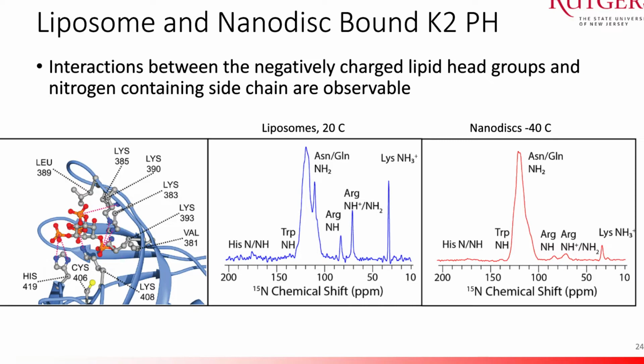But there's actually some chemically interesting things here. I think the histidines are spread way out. But they show up pretty okay on an NH2D, which I did not show because it was taken at 20 kilohertz, and I'm waiting until we get the 100 kilohertz data before I whip that out into public. I don't want to show broad proton line widths. But basically, we're really excited about our ability to look at these side chains using the NH2Ds moving forward.